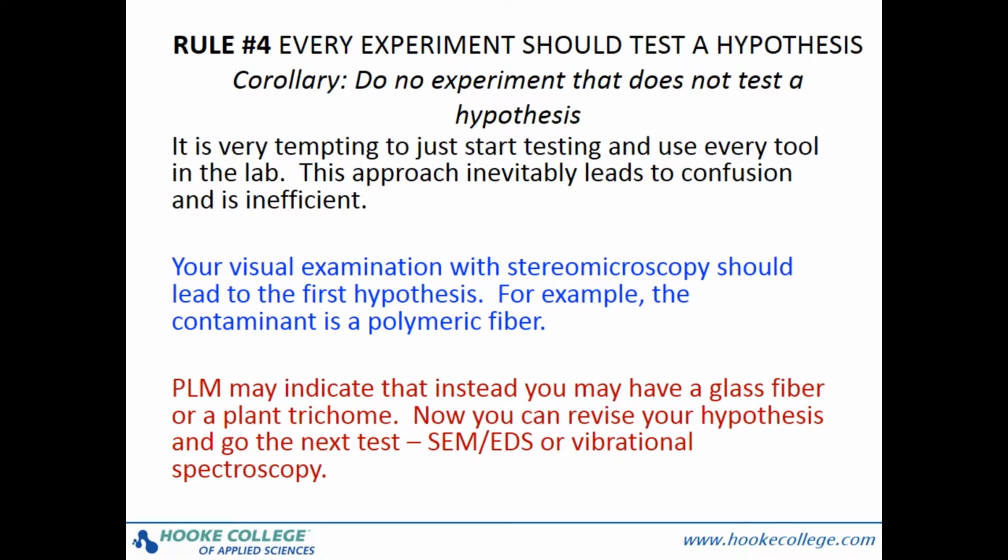I list the corollary about doing no experiment that doesn't test a hypothesis from experience. If the problem is important enough, everyone and their brother will be asked to work on it. You end up with a mass of data, some apparently contradictory, that can require quite a bit of time to unravel. Collecting data that does not test a hypothesis generally just confuses things, and frankly, it's just best not to do it.